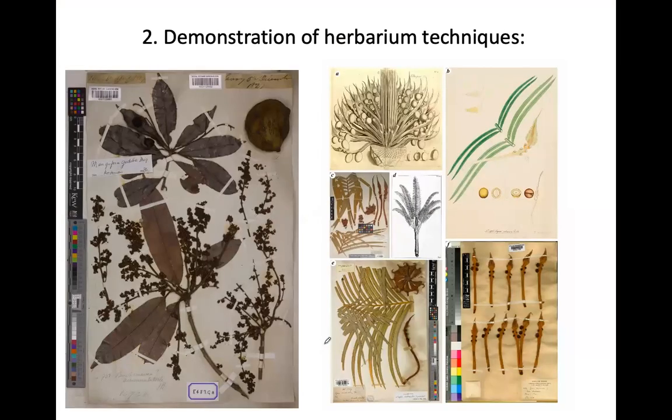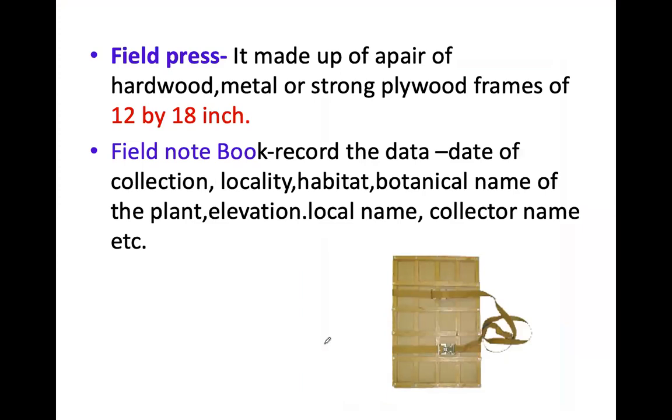Demonstration of herbarium techniques. We will talk about the field press. It is made up of a pair of hardwood, metal, or strong plywood frames of 12 by 18 inches. This is the field press frame. What is the measurement? 12 inches by 18 inches.